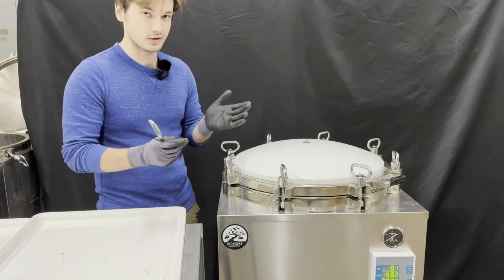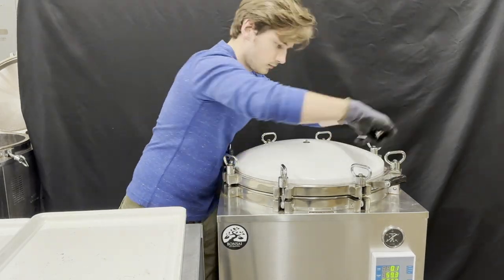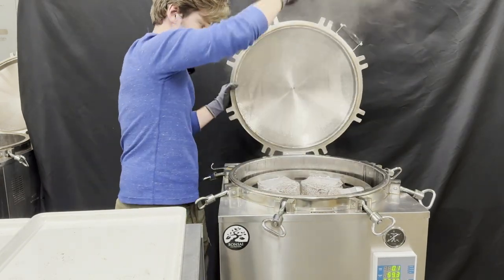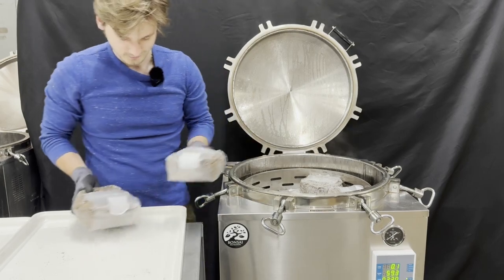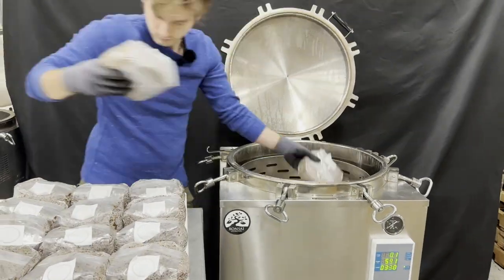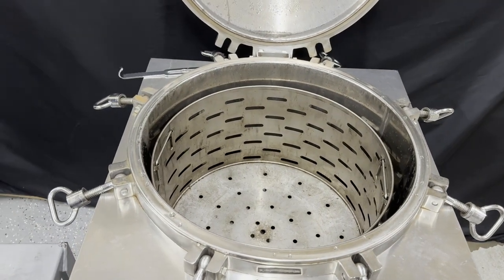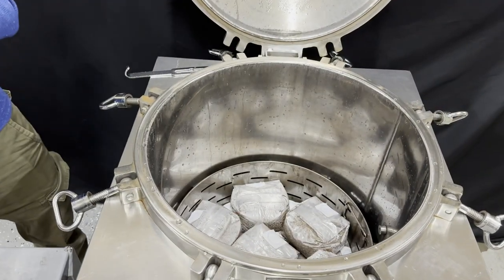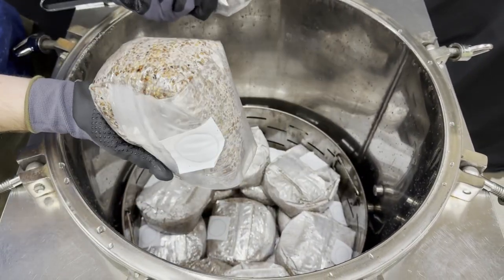Now we are at our other warehouse with our 150-liter autoclave — this is our three-year-old unit. It just finished its sterilization cycle, so we're going to go ahead and unload it. Perfectly cooked grain — the bottom's looking good too. No exploded bags.